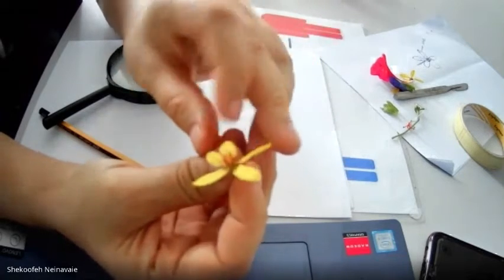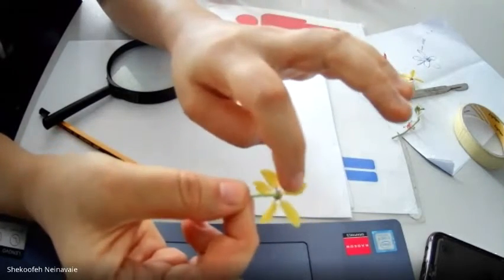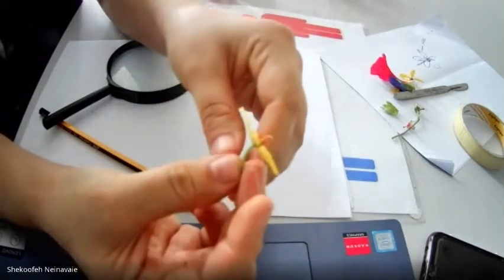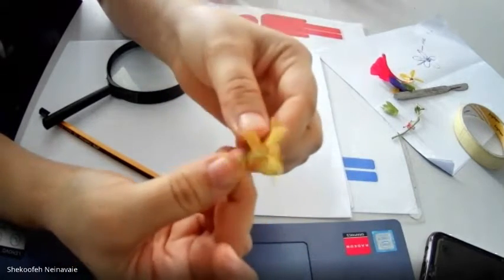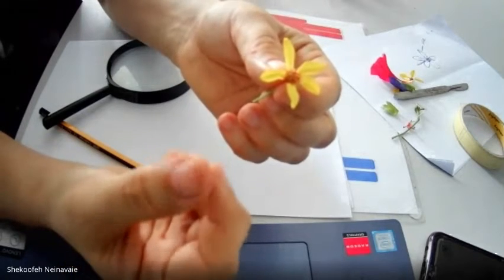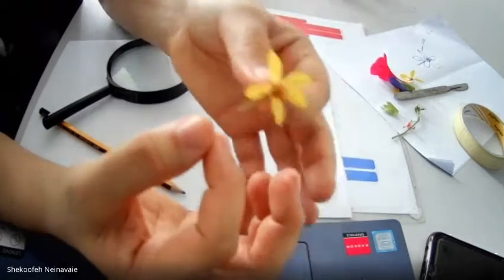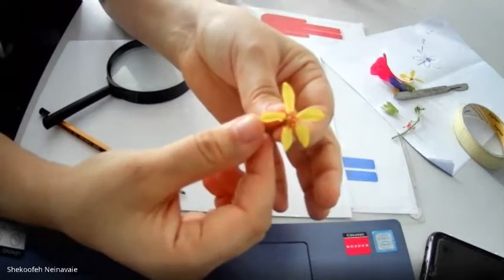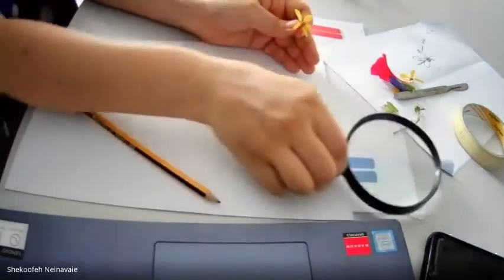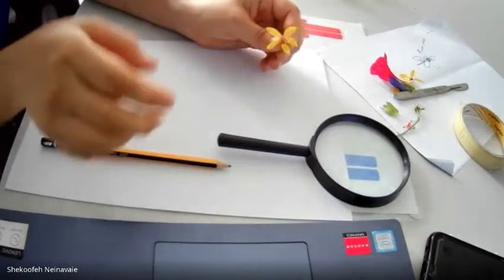So there are petals, and then there are sepals. A sepal is green, like a small leaf on the flower. Well, this one is very small. Then the ovary is like a bulb, a small rounded thing inside. When I open it up, you will see inside the ovary the ovules, the female gametes, small gametes. They are not fertilized yet. When they get fertilized, they turn into seeds.